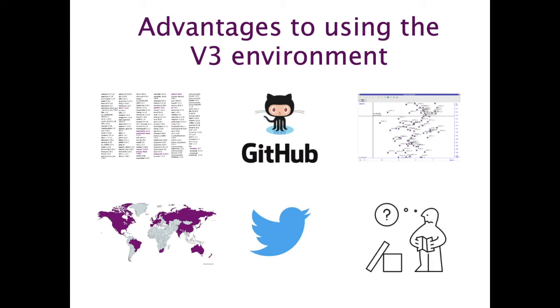And finally, we can also help you with preparing some of the documentation. So obviously we've got our YouTube channel where we do video tutorials. We can easily incorporate one using your tool, and we can also host some other documentation on our website if you don't want to have to host your own website.